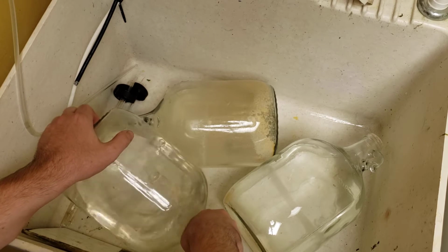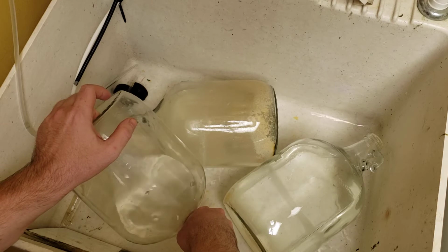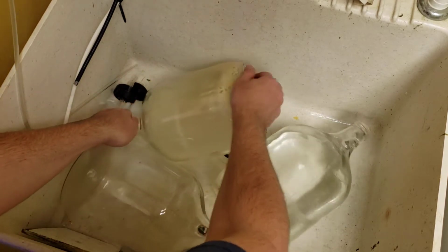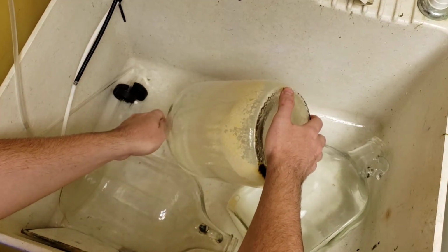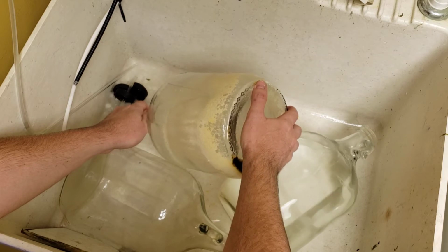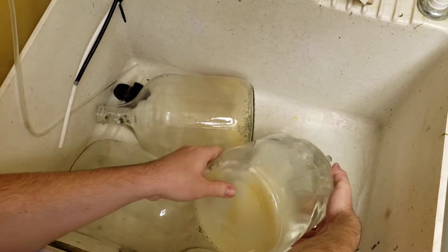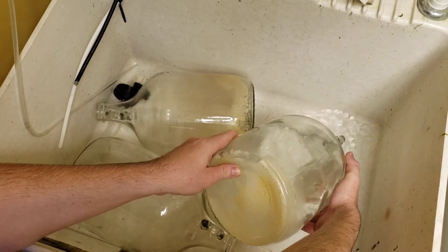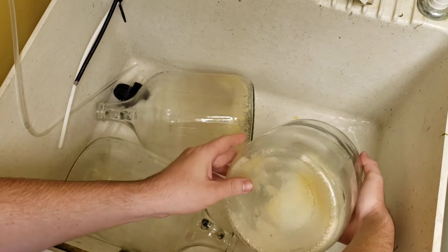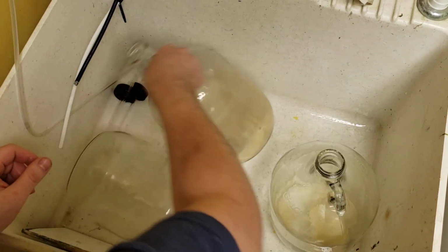So we want to make sure we drain all the bleach water out and rinse it really well, because next we'll be using acid to finish cleaning. Be very careful when you do this not to get your shirt wet. This bleach will wreck your shirt very quickly. I've lost several shirts this way.